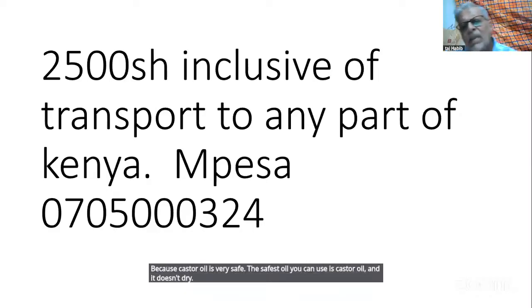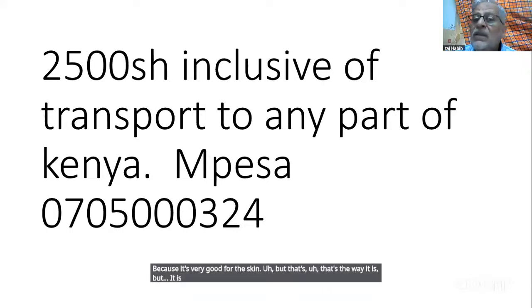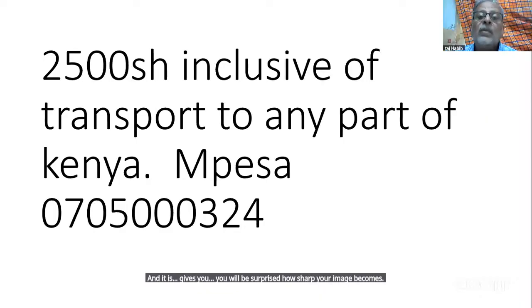The only problem with castor oil is if you buy it, it tends to disappear from the lab. Some people take it home. That's the only disadvantage, because it's very good for the skin. But that's the way it is. It is not expensive. It has been tried. It doesn't damage your objective. You will be surprised how sharp your image becomes as compared to whatever is in the market today.